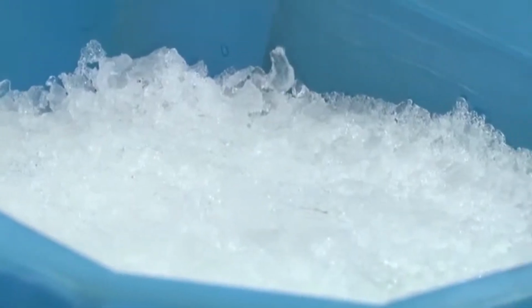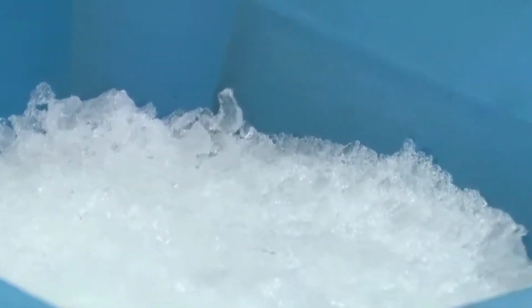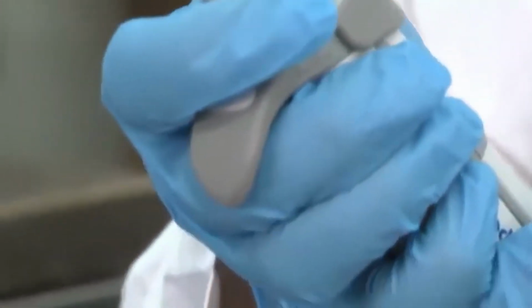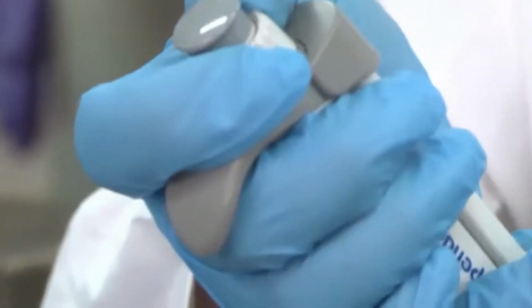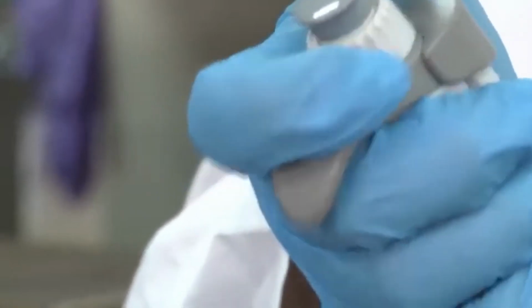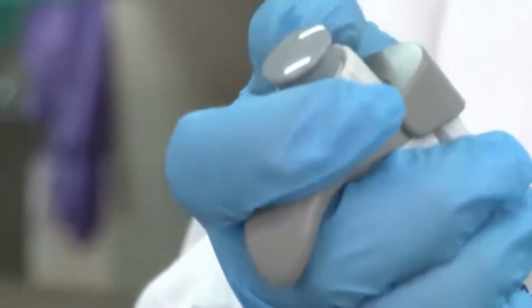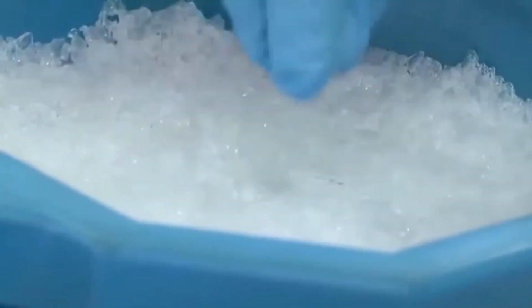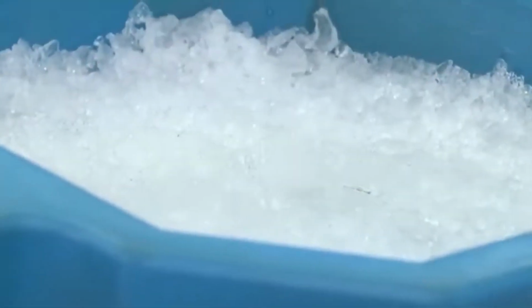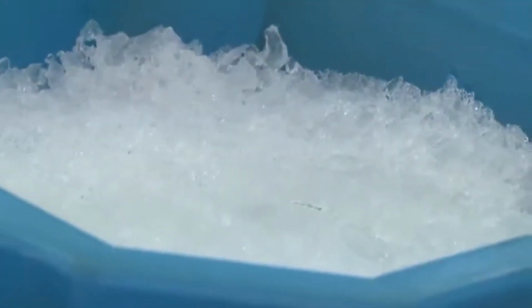So, I am now going to set my pipette at 1 microliter, because that is the amount of DNA that I am going to be adding to competent cells. You can add slightly more DNA as well. You can add maybe 2 microliters or 3 microliters if required, but 1 should be fine. We tested our competent cells earlier with different constructs, so they are very nicely competent. So, even 1 microliter of DNA is sufficient for our purposes.